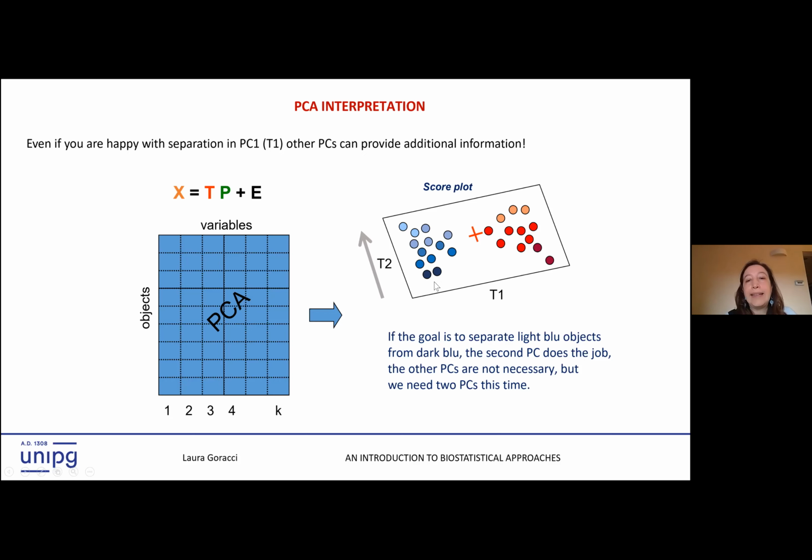It could be that this is the majority of the differences between control and treated sample, but the second component is telling you that these are the old samples and these are the newest samples collected. This is simply an example to tell you that if you are able to interpret what happens in another variable, maybe that could be a good way to add a second variable here.